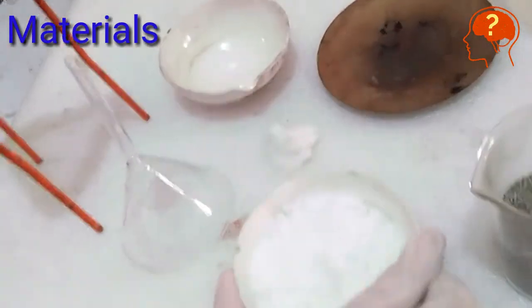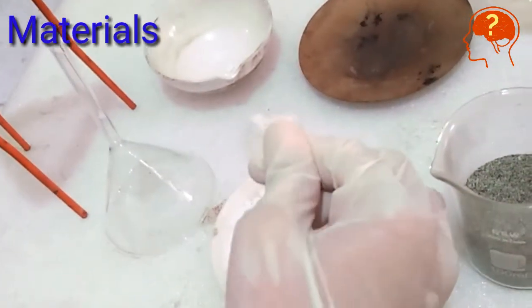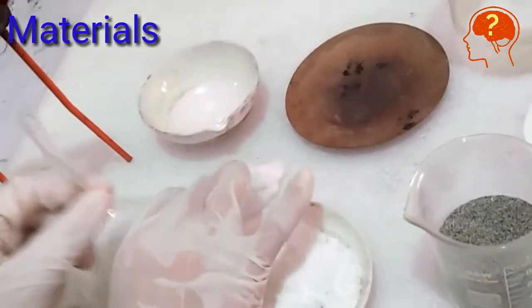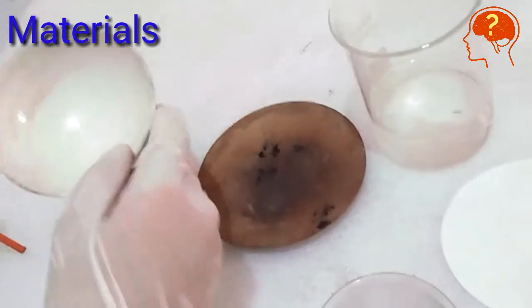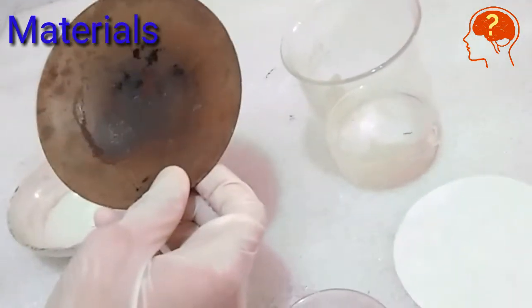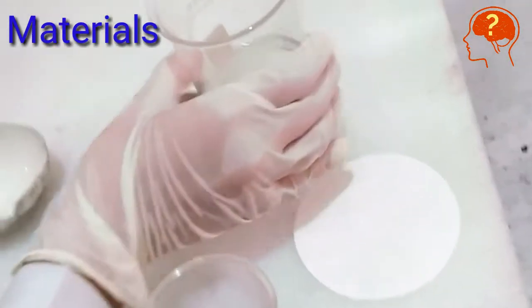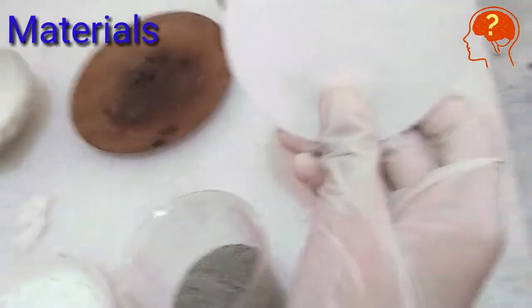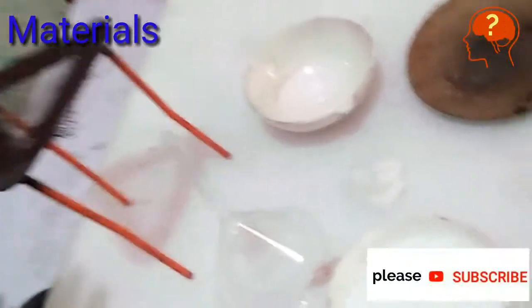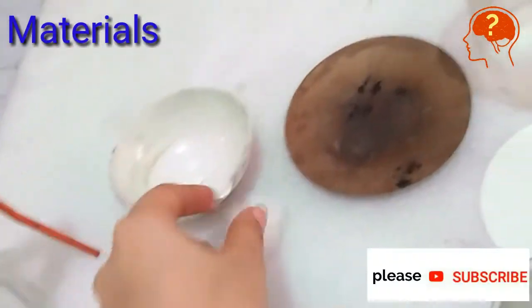naphthalene (it should be finely powdered), funnel, china dish, sand bath, water, filter paper, tripod stand, and cotton.